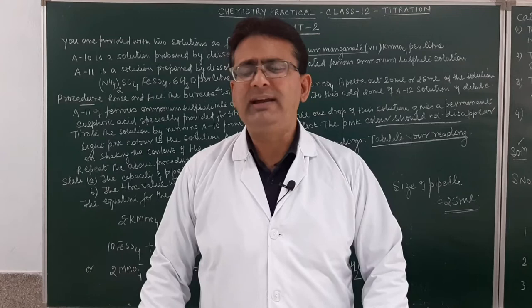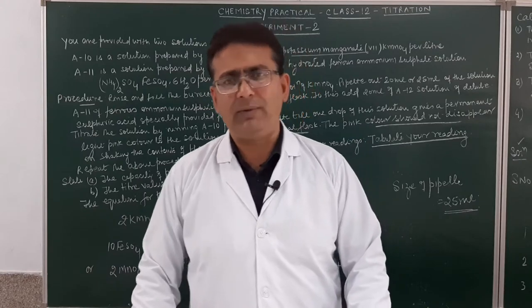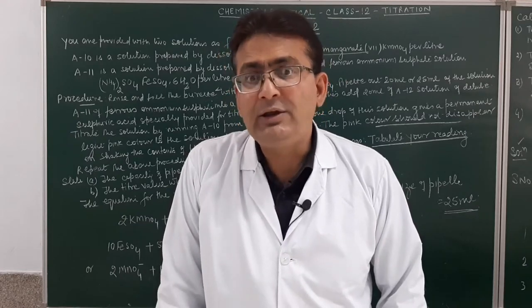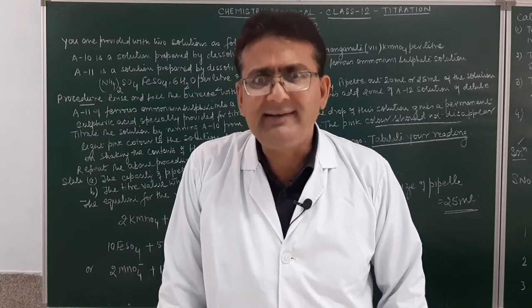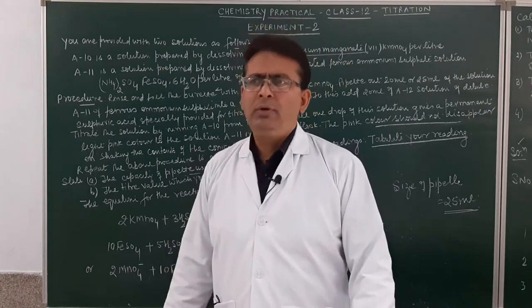Today we will be doing experiment number 2 with you. In this experiment, we will again go for the titration of KMnO4 versus ferrous ammonium sulphate. Students, in the first video, we determined the value of X and the molecular mass. In this titration, we will try to determine the percentage purity. The process will be the same.